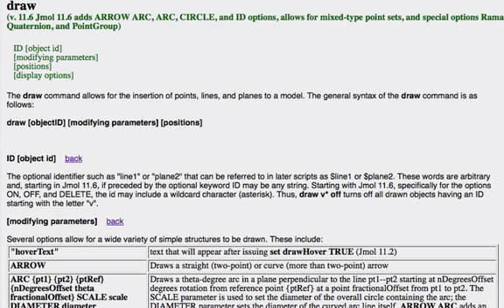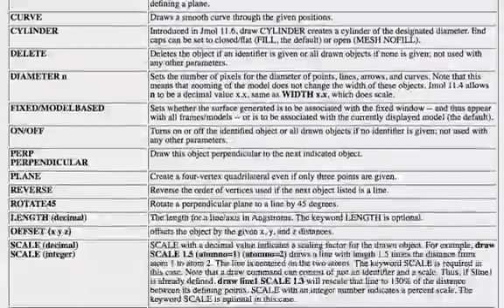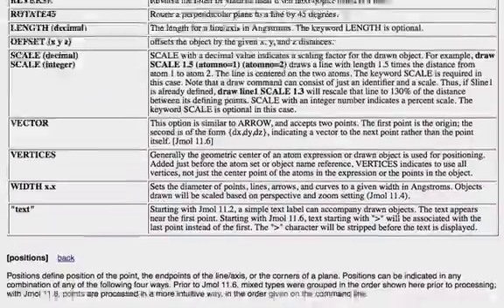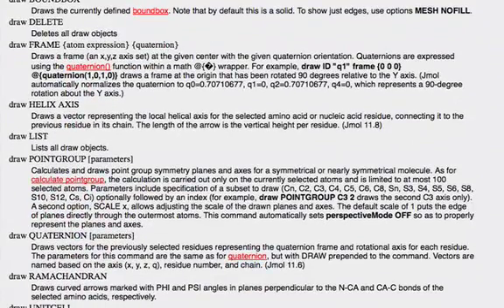One of the first things I'll draw your attention to is the interesting draw ramachandran parameter. Using draw ramachandran, you can draw curved arrows for selected residues that show the phi and psi angles and label the residues with the actual numbers. This might be interesting to do around the active site of a protein that your molecule interacts with.